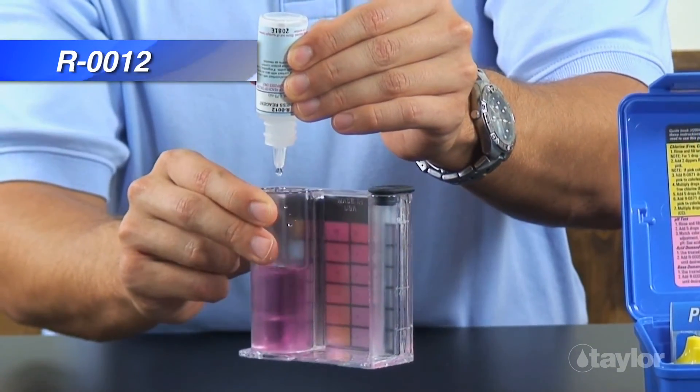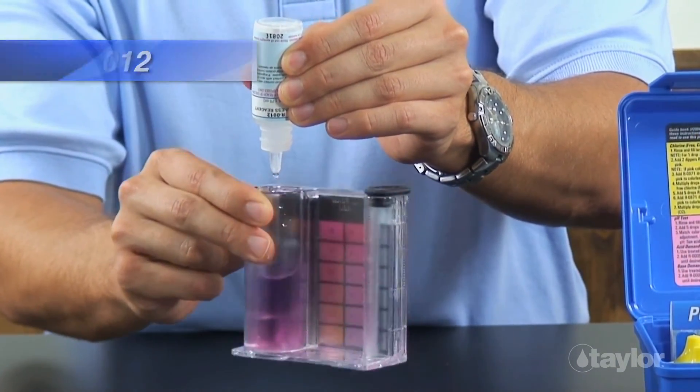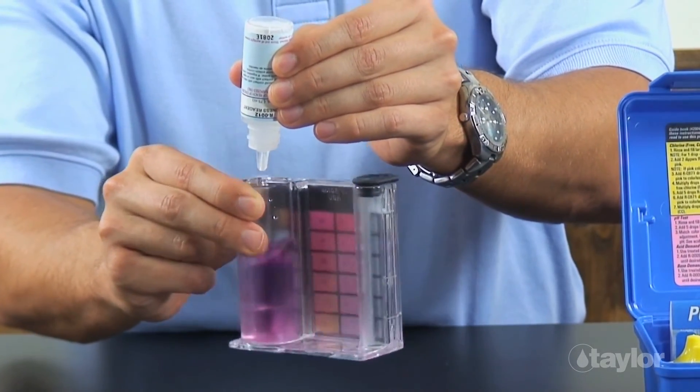Add reagent 12 drop-wise. After each drop, count and swirl to mix until the color changes from red to blue.